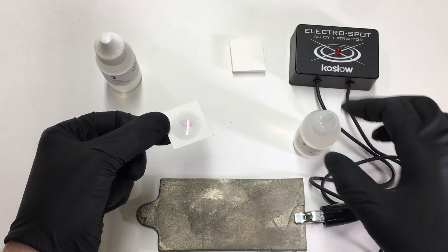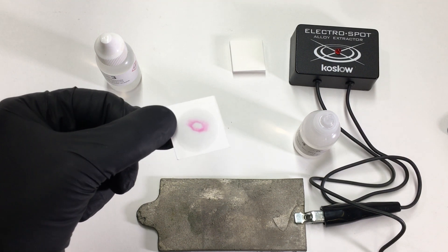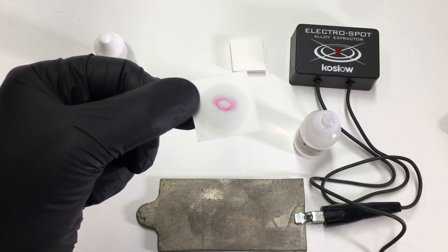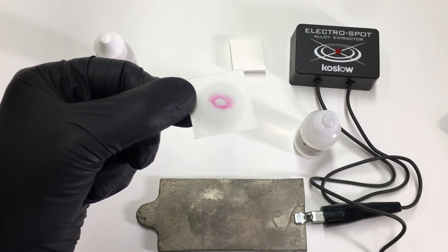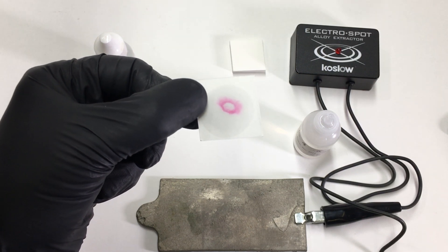I'm looking for a pink color. This developed very quickly, so I could say without a doubt this material contains nickel. It's either a nickel alloy or it's nickel plated.